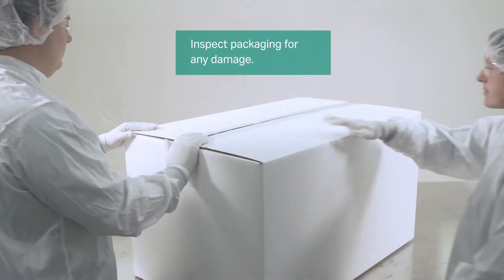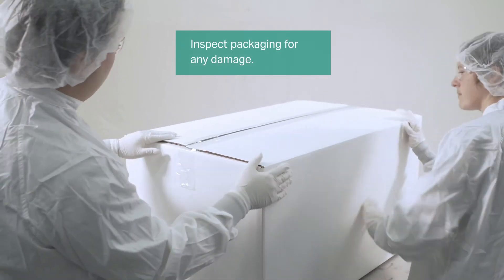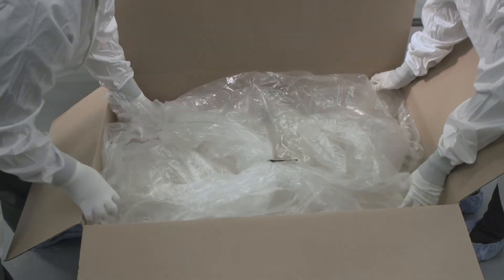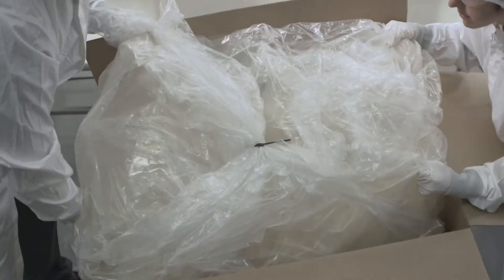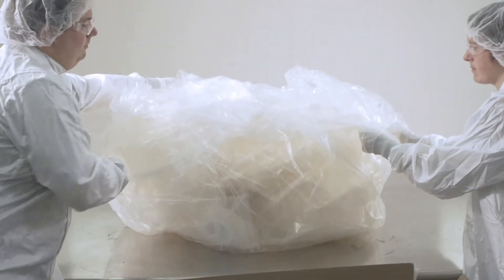Inspect the box. If damaged, record and photograph the damage and inform your Cytiva representative. Now open the box and take out the disposable bag assembly and place it on the inspection table.